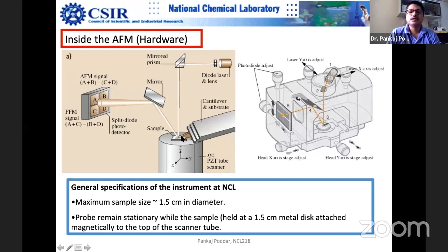When the cantilever is far away from the surface, it is resonating, so obviously it will move up and down, and you have constant movement of the beam here also. That means this signal will also be sinusoidal, because it is a sinusoidal movement of the laser spot. So this voltage will also have sinusoidal movement. That's how you can pick up the frequency of its movement right here. The voltage frequency will be more or less the same as this one.